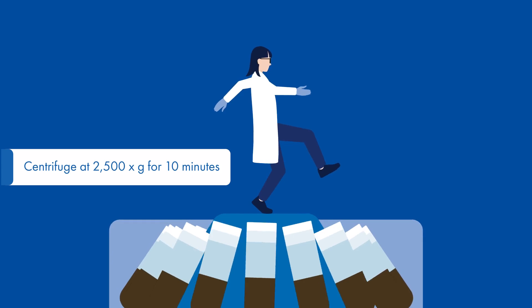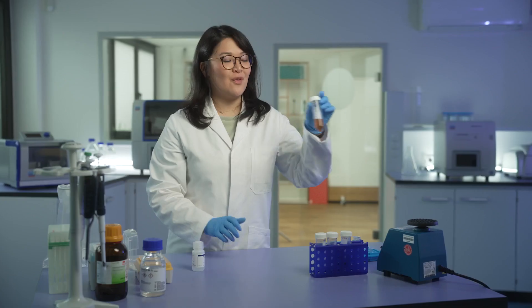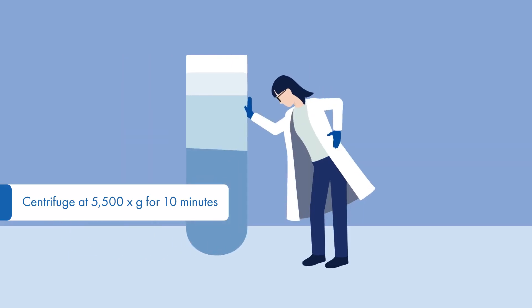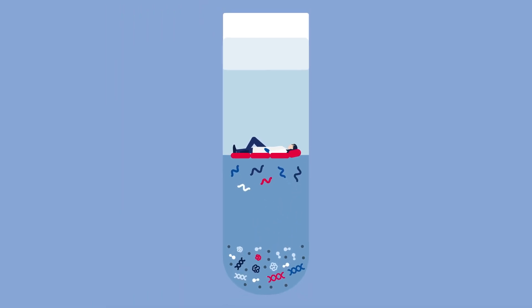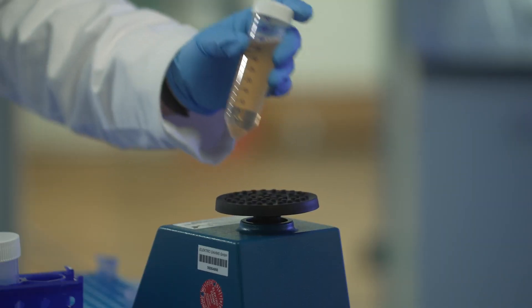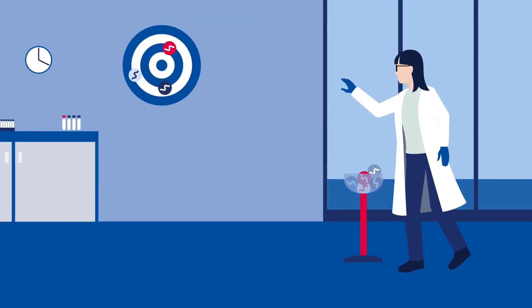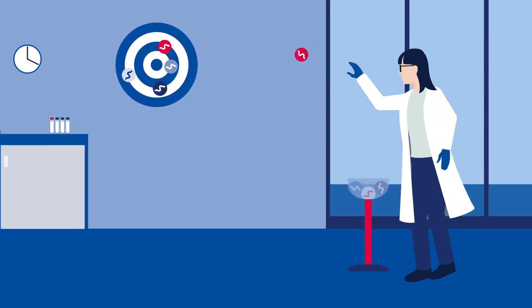Transfer the supernatant into a new 50 ml tube. Add solution CD2, vortex briefly for 5 seconds, and centrifuge again. Solution CD2 removes contaminants that interfere with downstream PCR analysis. After centrifugation, decant the supernatant. Add solution EA and vortex briefly for 5 seconds. Solution EA contains chemical components that optimize the binding of RNA onto the silica membrane of the MB-spin column.